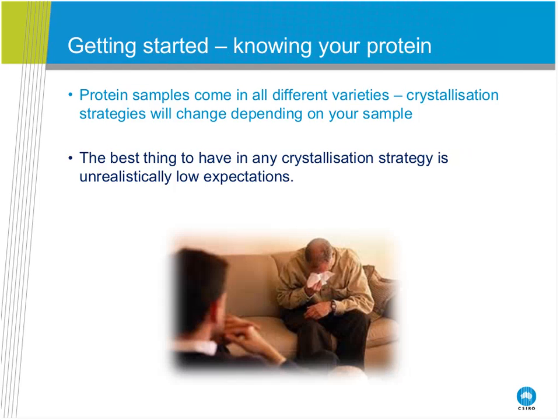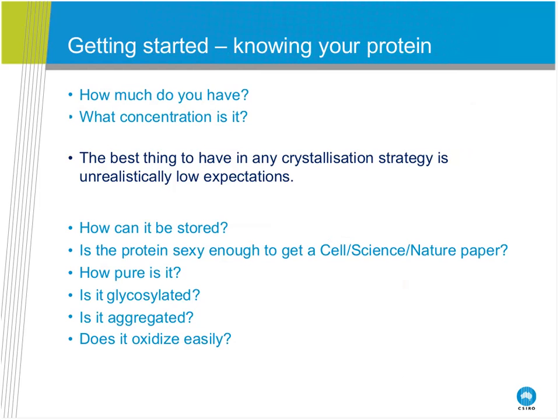And so I show here a picture of some chap who's just had it pointed out to him that his crystallization experiment did not work. So to avoid things like that, we just walk in with an unrealistically low expectation. So expectation management, keep that in mind. It's probably the most important thing a crystallizer can have.